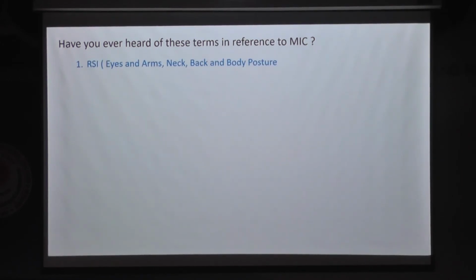This is the last slide for mine. So what happens here is repetitive strain injury. Repetitive strain injury while using microscopes will be enormous. While using a microscope, if I am moving my hand from focus to the knobs of the stage movement, maybe 1,000 or 2,000 times, probably every clinician or every pathologist will move. But unknowingly, the strain is developed within the hands.